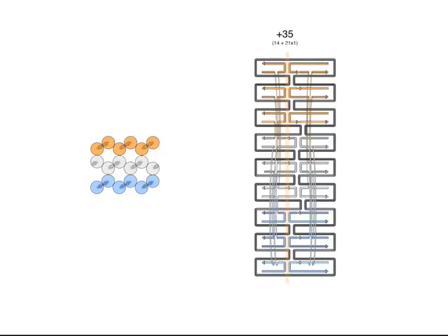So why didn't we include the staple crossovers in the middle layer, for example, at this position? There could have been a staple crossover from here to here. Well, we already have a scaffold crossover between the same two helices, only five bases away at this position. We want to avoid kinetic traps that might occur if you space scaffold and staple crossovers so close together, so we've omitted the nearby staple crossover in this position.